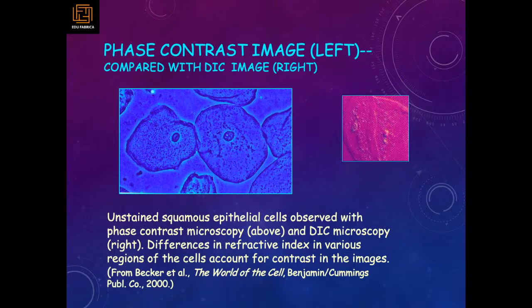So the thing is, it depends on what your use is, what kind of microscopy is in your lab. Whenever you're going to join any lab, just check what kind of microscopes they have, and according to that you do your experiments and get your results out. Sometime I was doing one experiment for one whole year, and I was not aware that there was a very nice microscope present in my neighbor lab, which could help me get better results. Some of my friends just told me, oh, if we just talk to the PI in that lab, we can get very good results out of it. So that's also one thing.